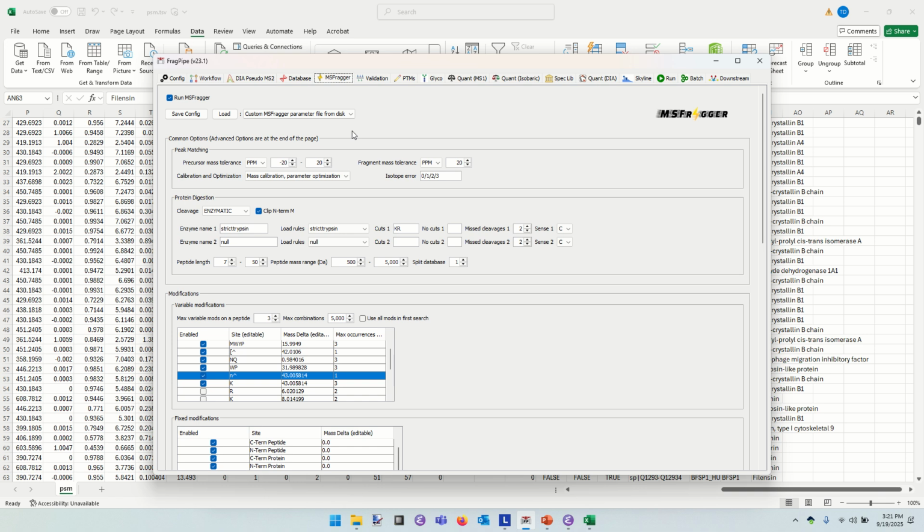I would say that the bigger problem is that when people do PTM hunting, they do so with the assertion that having a PTM just changes the mass ladder. But the reality is a lot of PTMs change how the peptide fragments. And that's the problem. So let's imagine that you've got a big glycan structure stuck on your peptide.